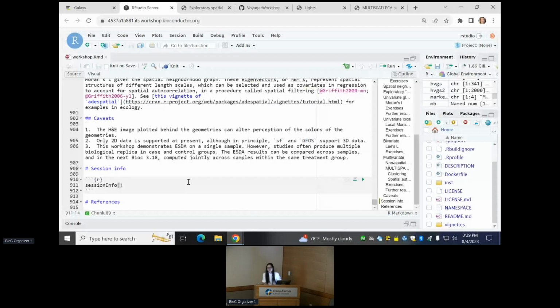I've always had these thoughts about R packages. It looks like you could do this with this R Markdown methodology: you could have a check suite, a suite of R Markdowns, that you just run to make sure everything's running okay. So if you have a different version, you just run them automatically?